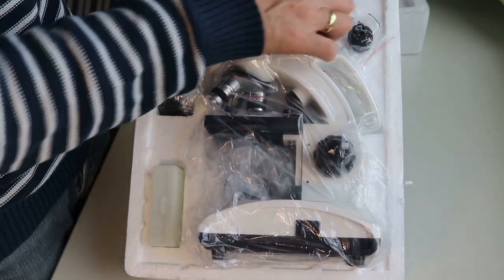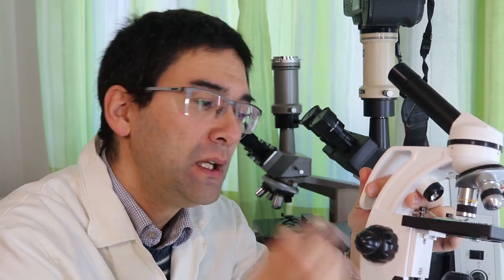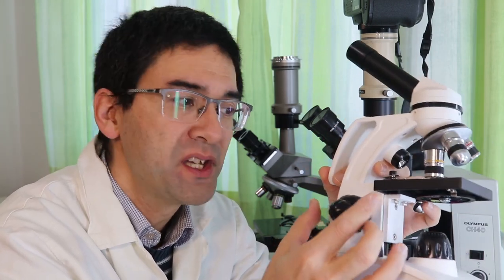So let's unpack it. Based on what criteria did I choose this microscope over other low-cost entry-level microscopes? Well, there were essentially the following. First of all, I could buy it over Amazon, so accessibility and easy availability was one of the important criteria. But about the microscope itself, there are not that many extremely low-cost microscopes that have two focus knobs, a coarse and a fine focus. But this does have one. So this was actually a primary criterion as well.